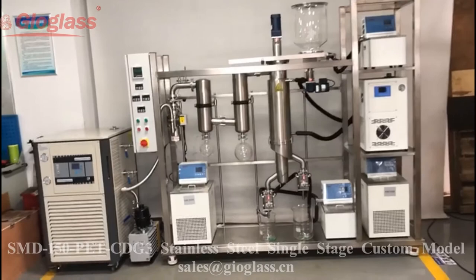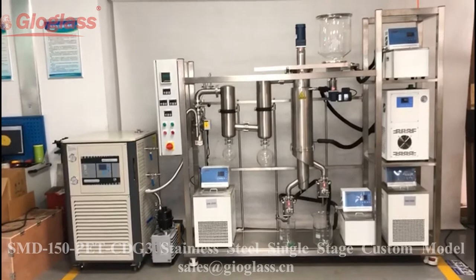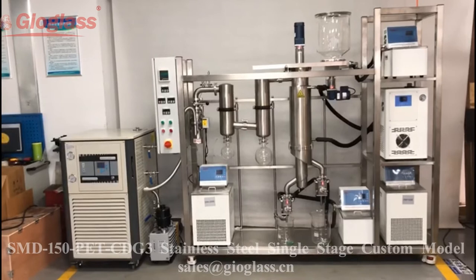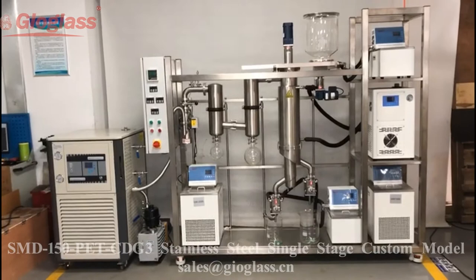Hello everyone. Today we show you our single-stage stainless steel short-path distillation system. This is the custom model. The model number is 150-P-E-T-C-D-G-3. Let me explain each component.